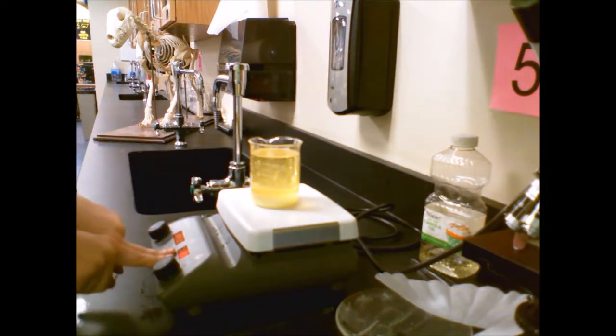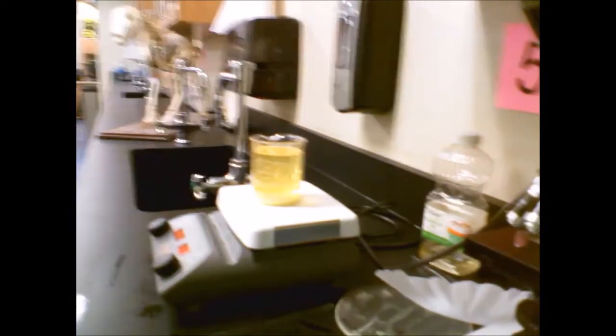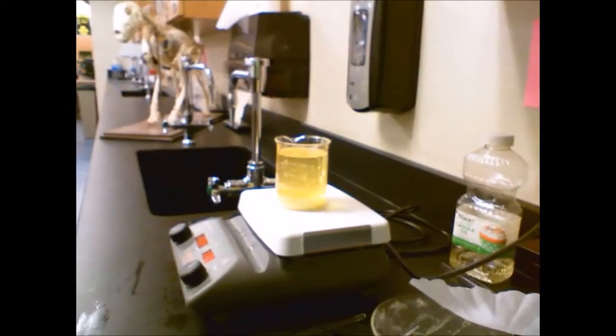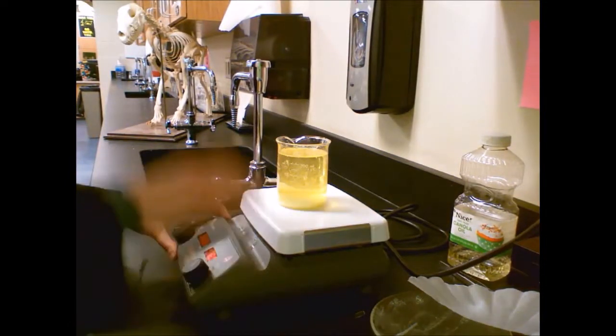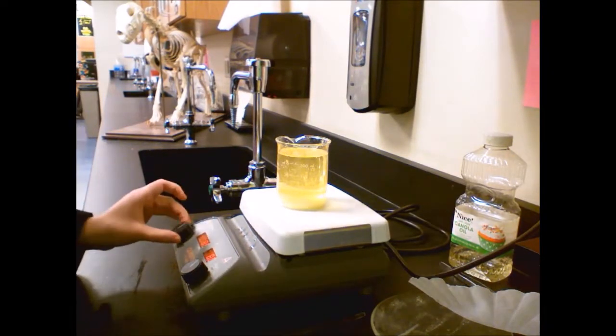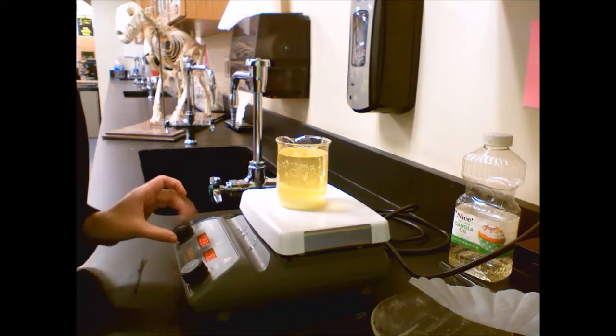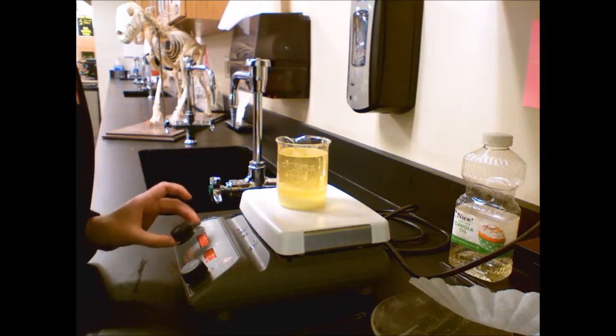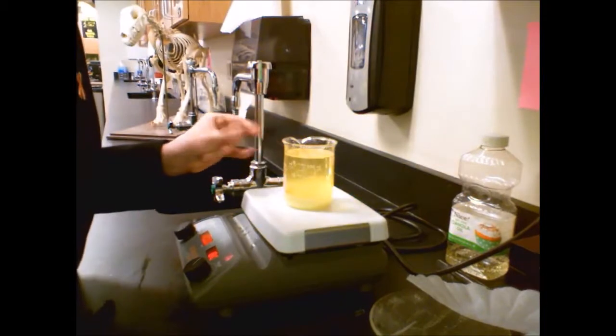So I have just turned this on. We have 80 degrees Celsius. This was the temperature that I determined to be sort of the ideal temperature for the dissolving of the sulfur. I also discovered that the stir stick I had is able to withstand high enough temperatures to do this.